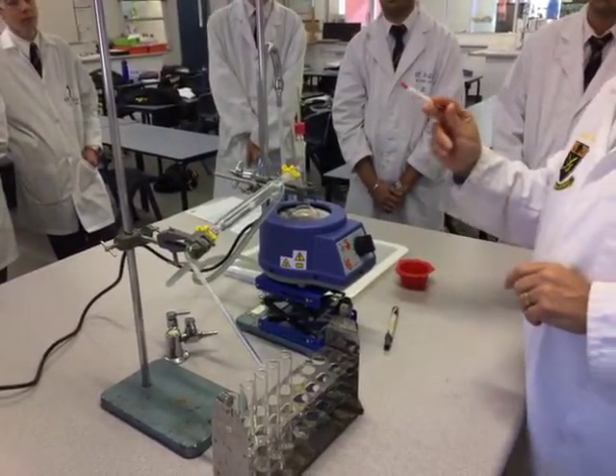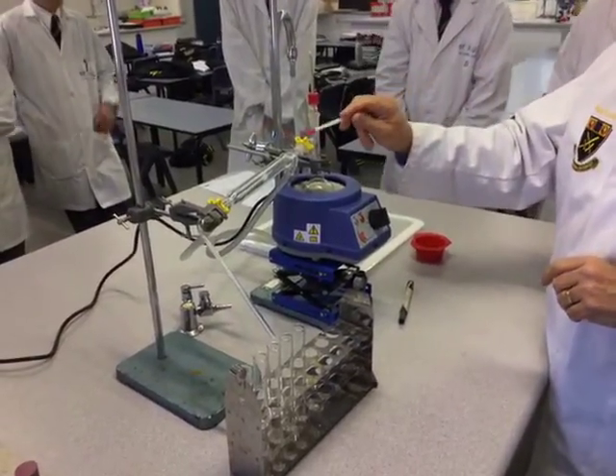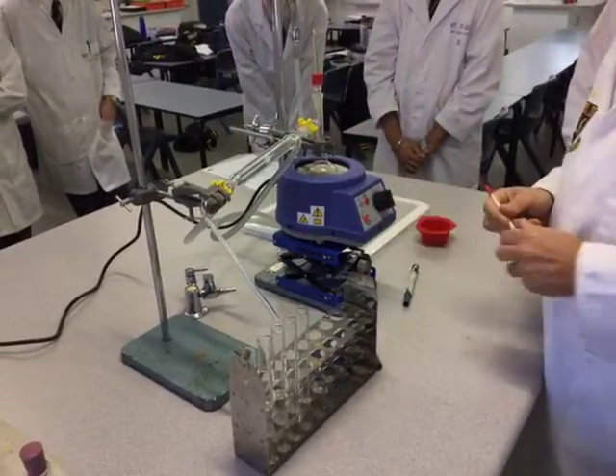What else did I forget? So we've got the thermometer set up, condenser sealed, water flowing from bottom to top — we're ready to actually collect our fraction.